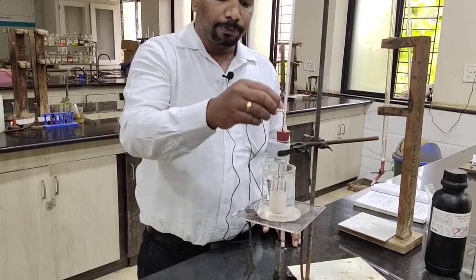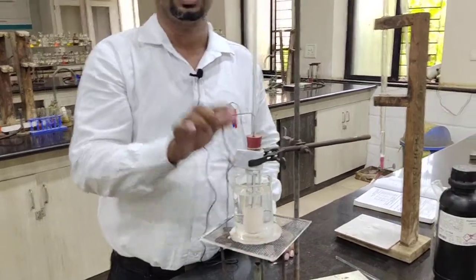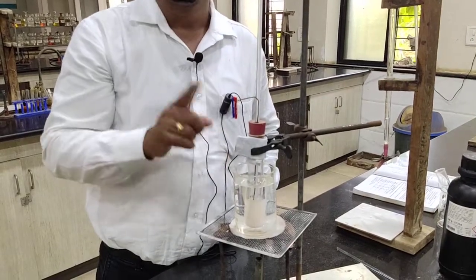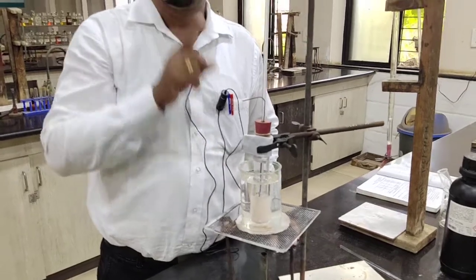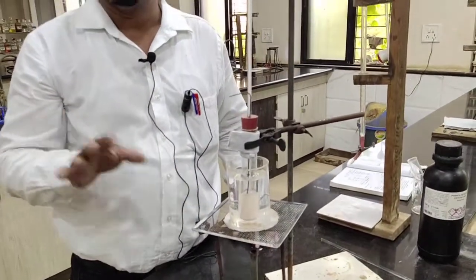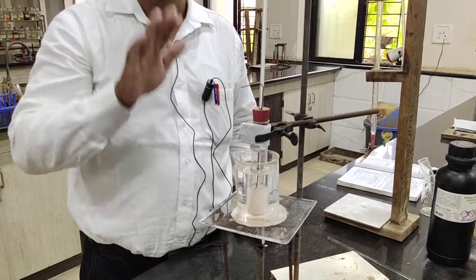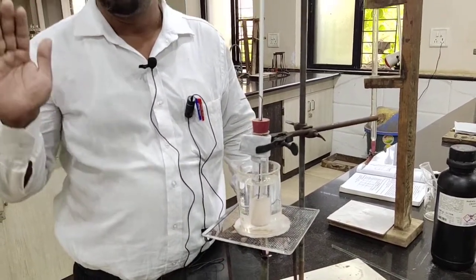So in the next step we decrease the percentage of phenol, do the same procedure, note the mixing temperature, and when the solution becomes turbid, note that temperature as T2. Again take the mean of T1 and T2. Similarly take 10 ml of water, 12 ml of water. So we decrease the percentage of phenol and increase the percentage of water.